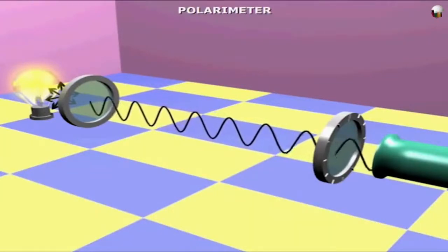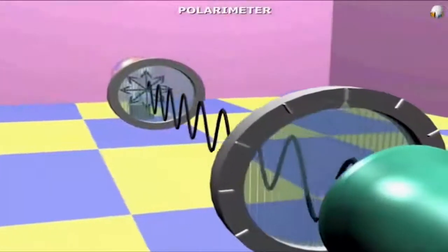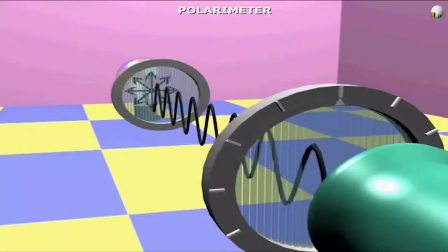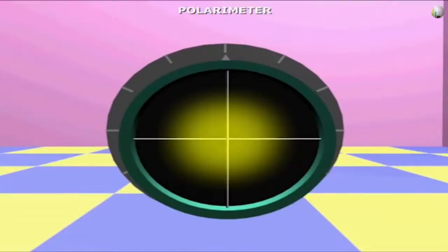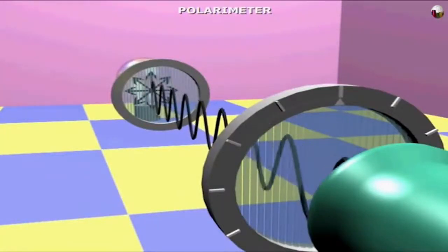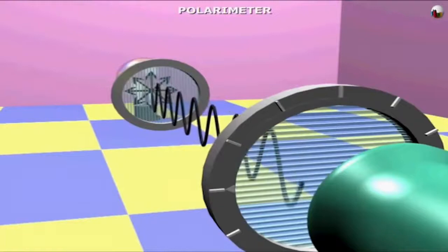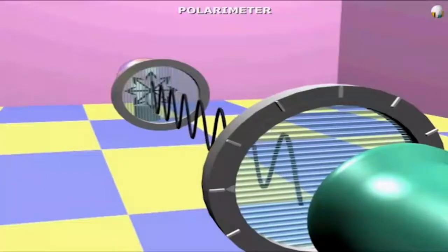Polarized filters have molecules arranged in a specific order that allows a light to pass through in only one plane. If the alignment of the polarizer is same as that of the analyzer, then we will see light glow through the eyepiece. Now the Polaroid filter of the analyzer is rotated through an angle of 90 degrees such that the analyzer's molecules are now perpendicular to the plane of the polarized light, resulting in no vibrations passing the analyzer, and we see darkness in the eyepiece.